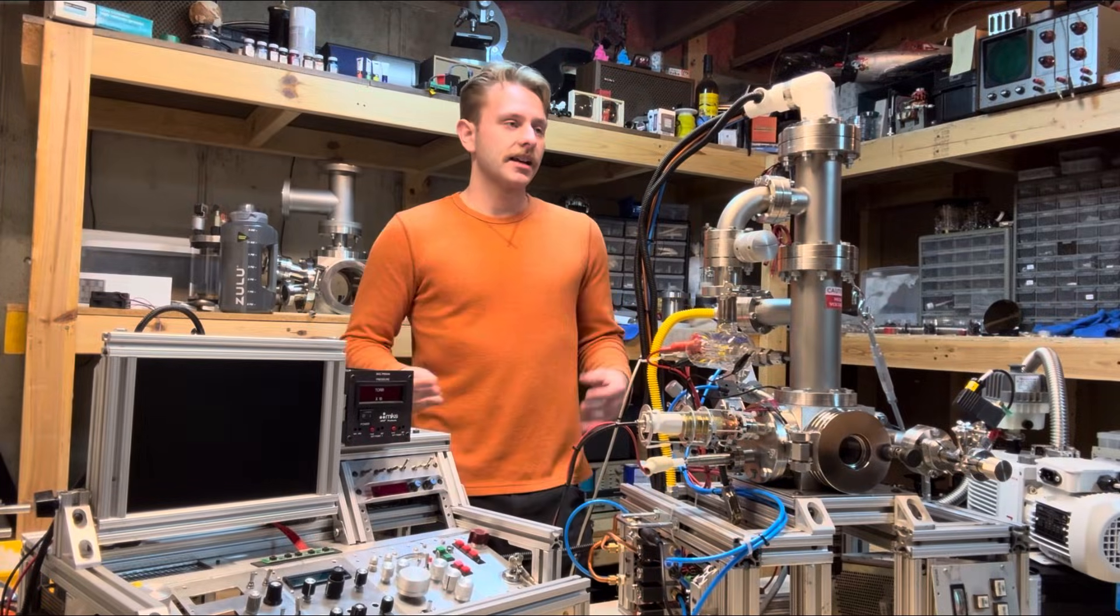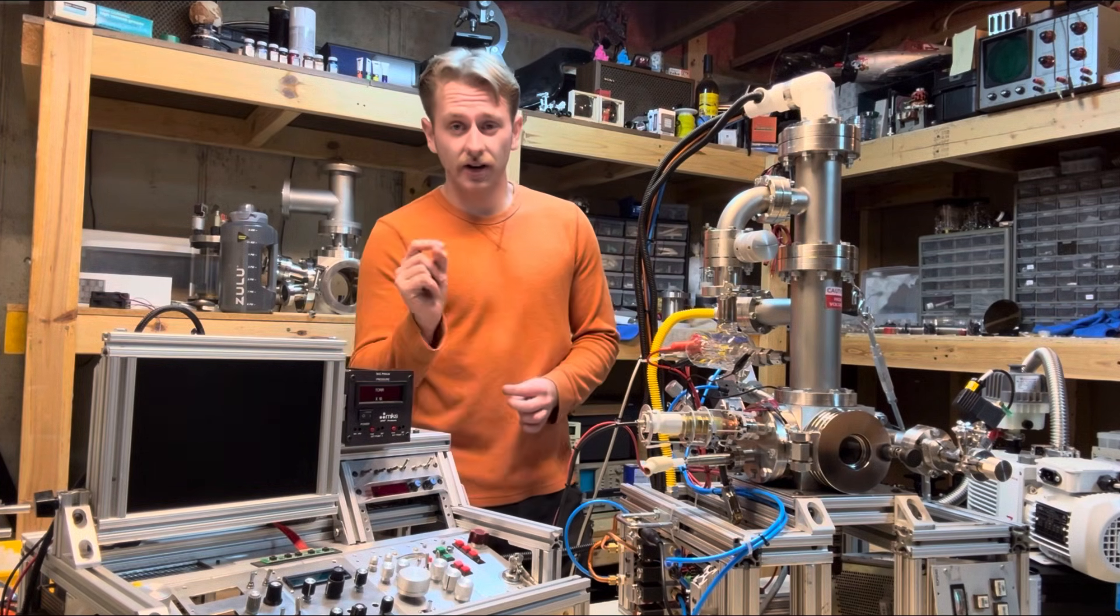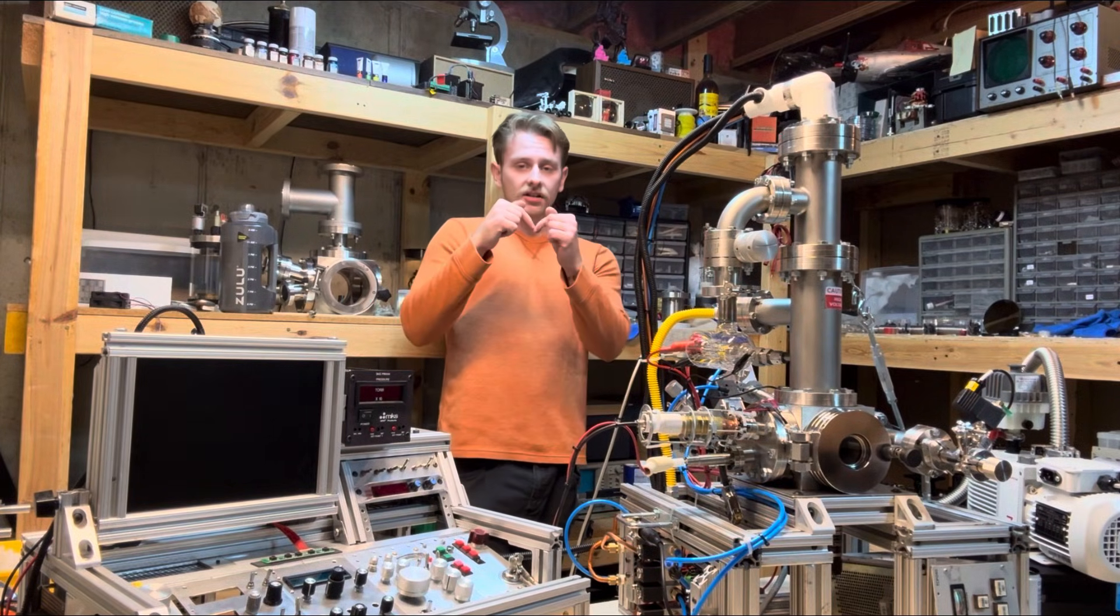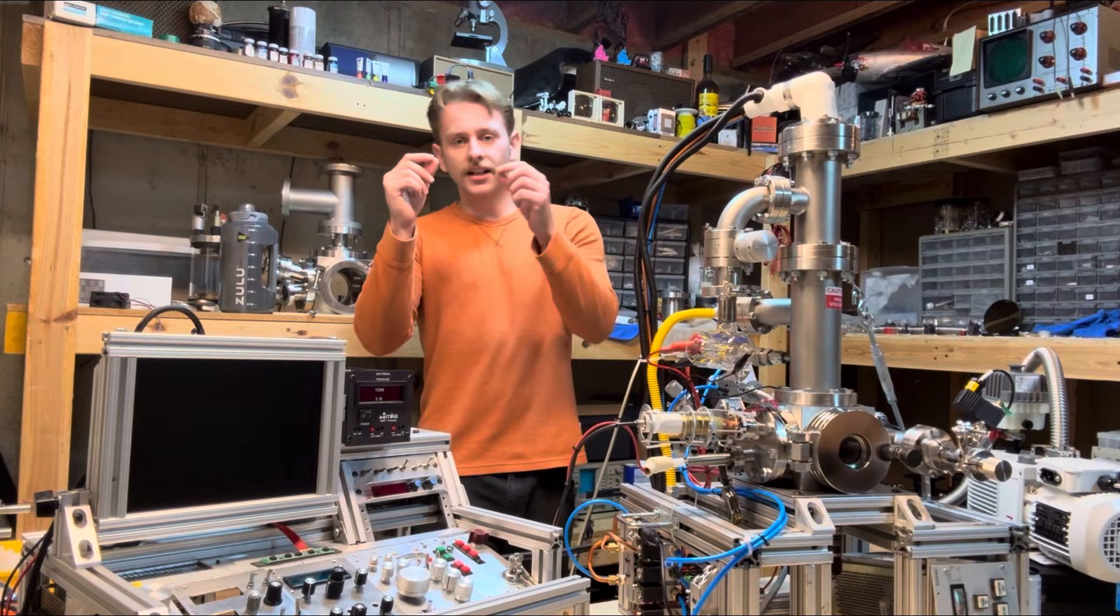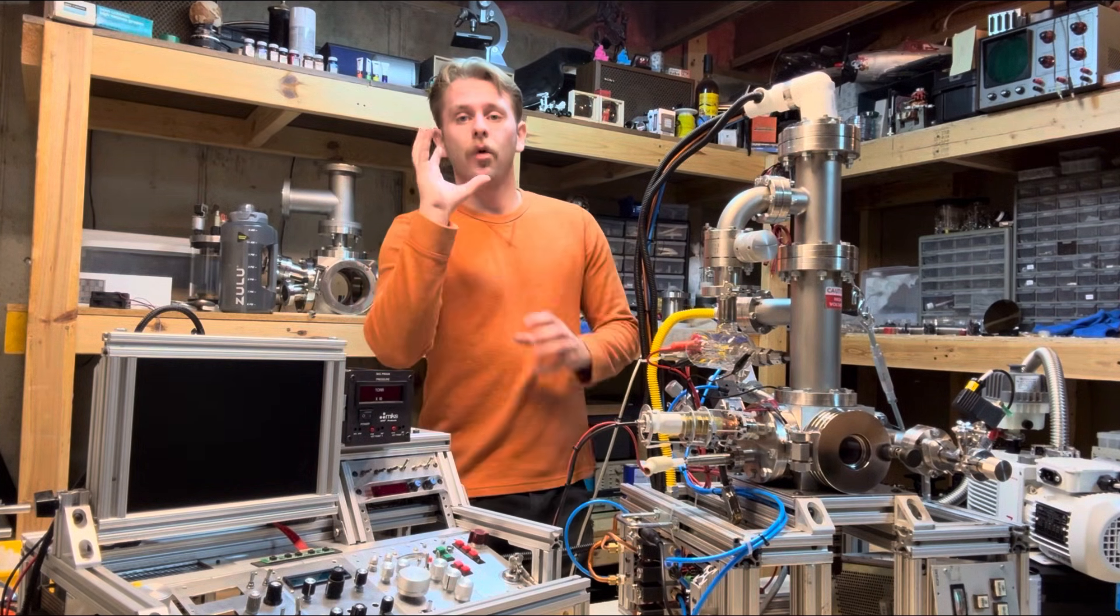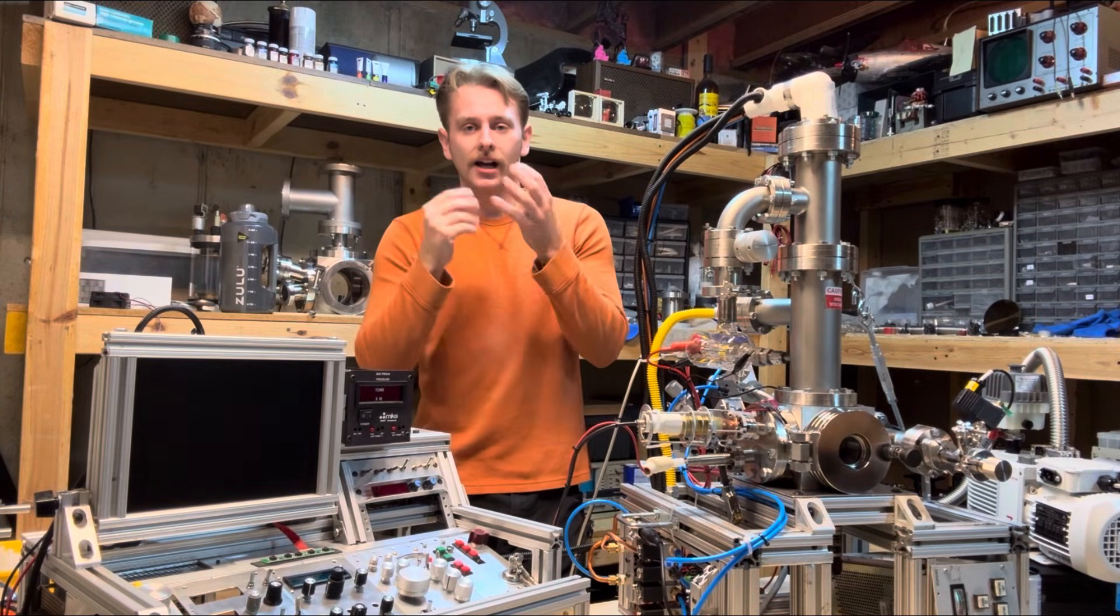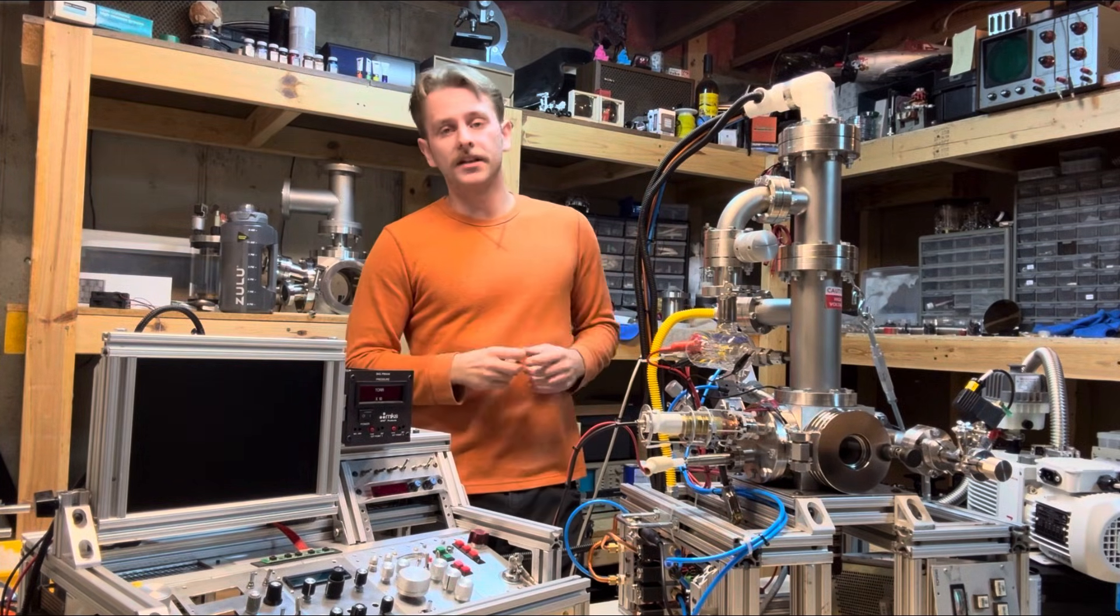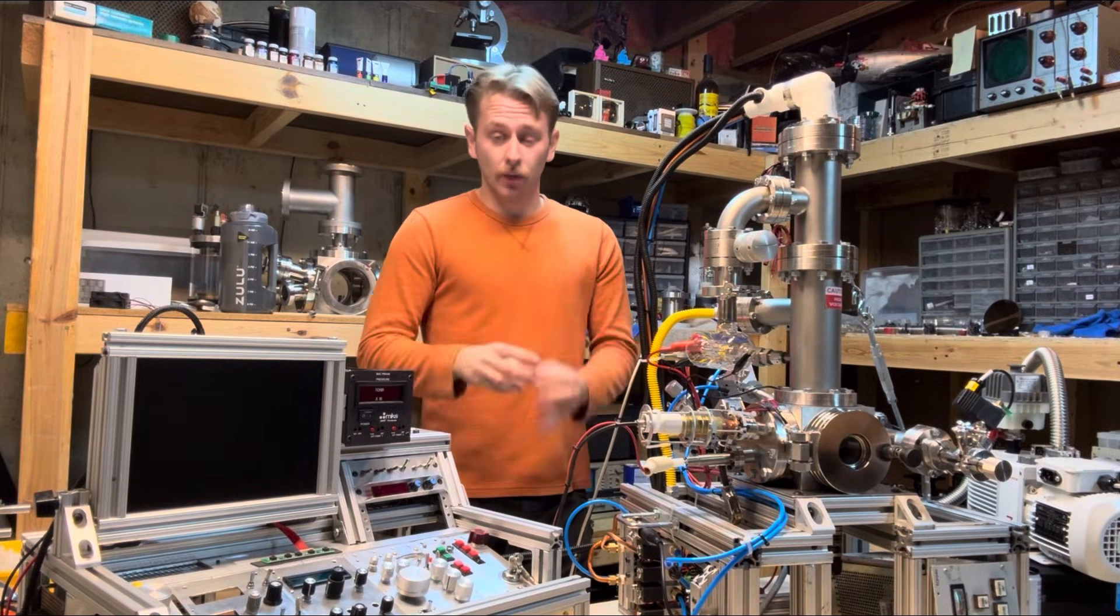So what happens is, I get like a tungsten filament, just like you'd have in a light bulb. And this is very similar to how a light bulb works. So you've got this tungsten filament and you heat it up really hot, like a couple thousand degrees. And then the electrons start to bubble off. Now on a light bulb, there's this white coating and it's phosphor. When the electrons are bubbling off, they're bumping into that phosphor and making more light. If you take a light bulb that doesn't have the phosphor, it's not very bright. But you put that white on there, it's real bright.